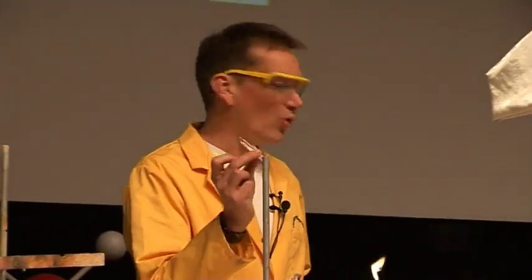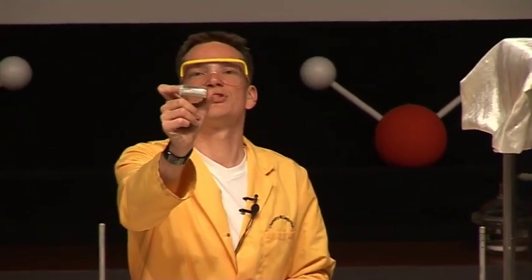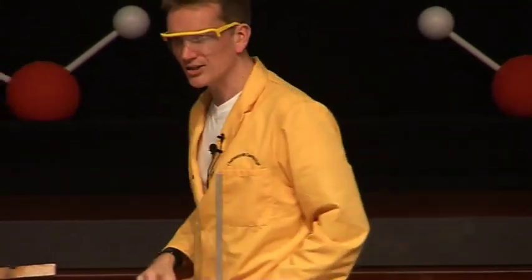And there's nothing left of this glass container whatsoever. All there is at the bottom here are tiny, tiny little fragments of glass. It looks like sand. This is some from the earlier lectures. So it's just powdered glass now. And that's because the liquid water, when we convert it to the gas, takes up so much more space.